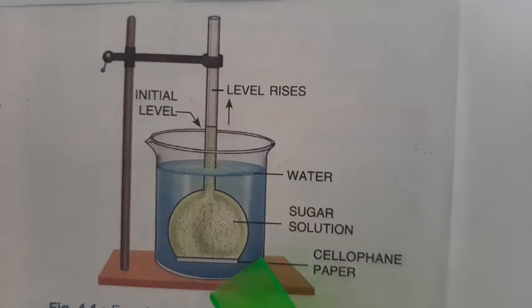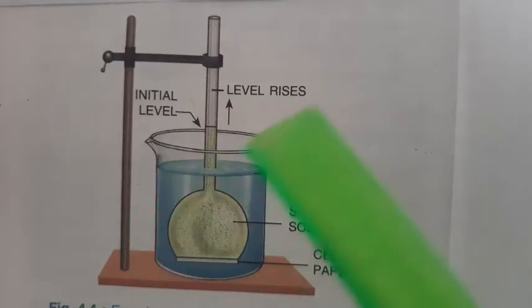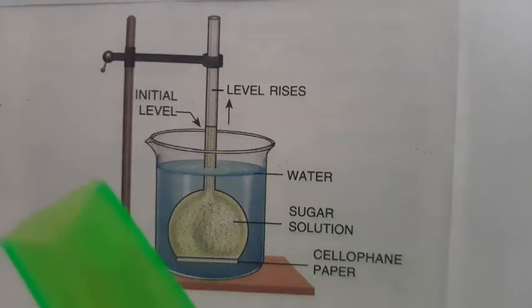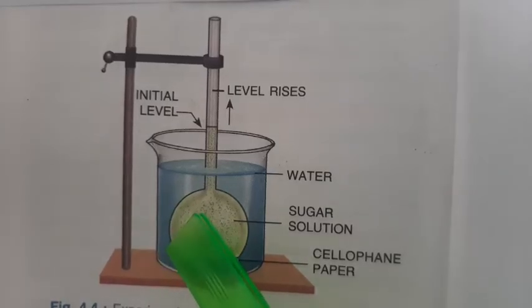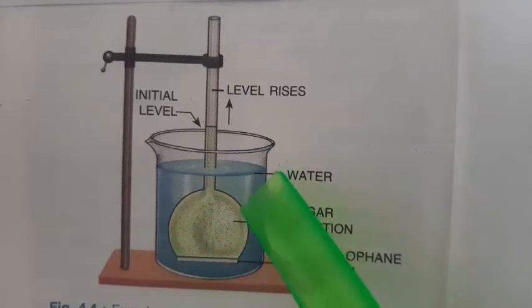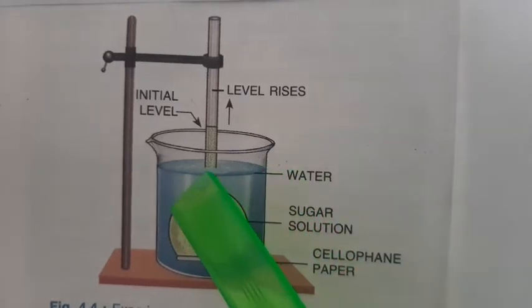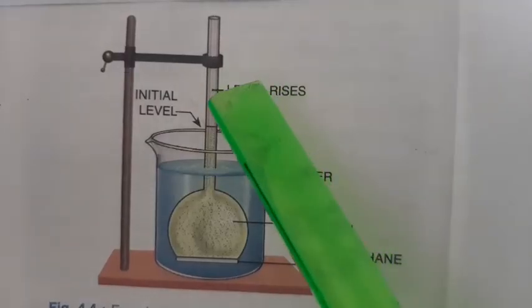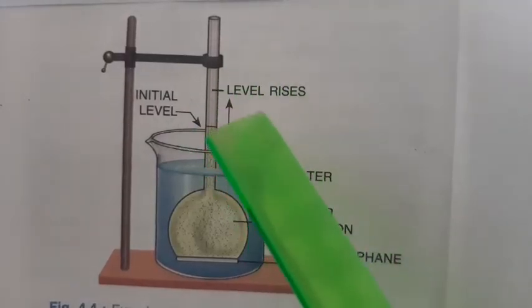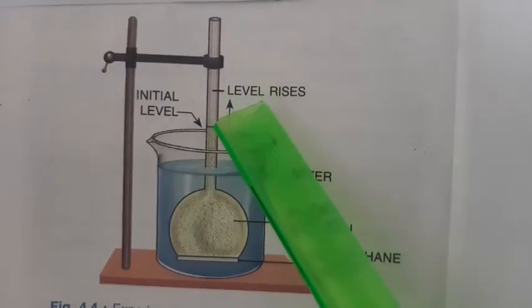This experimental setup is kept for two to three hours. Afterwards, when the apparatus is checked, it will be seen that the sugar solution has risen from its initial level and has gone to another level — the level of the sugar solution rises from the initial level to a new higher level.